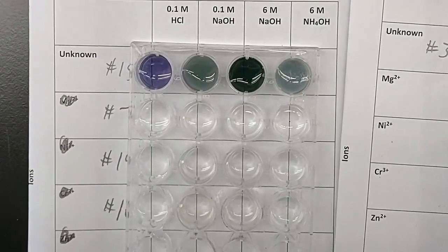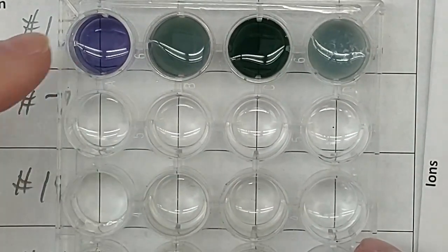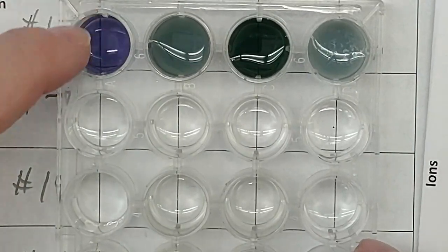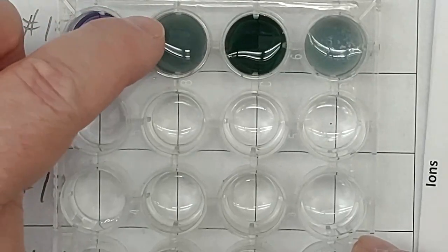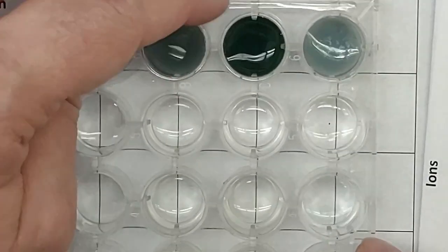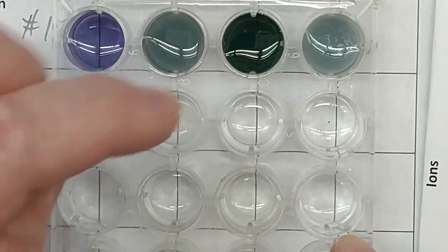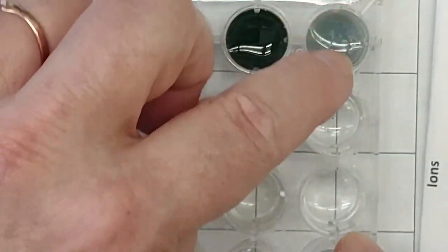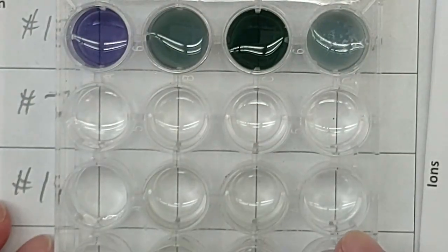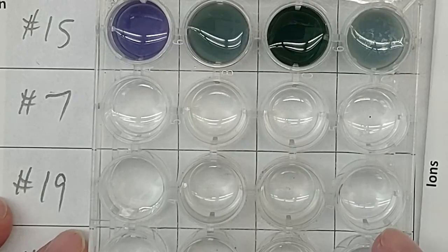Zoom in for you. You can see the line through there. That's clear or transparent and purple. That's a cloudy one. This one, it's pretty dark, but you can totally see the line in the middle if you look really carefully, if it's not too glary. This one's definitely, you cannot see the line. All right, so that's your observations that you're going to record for unknown number 15.